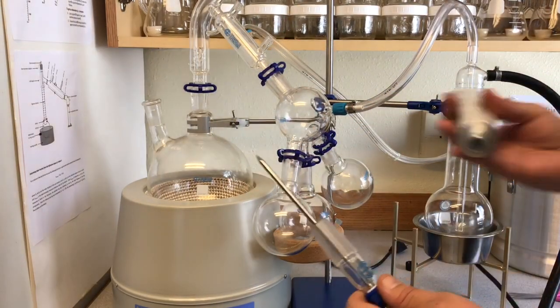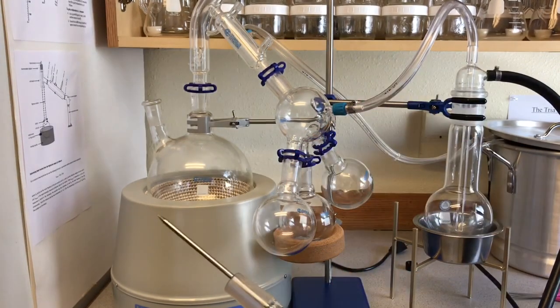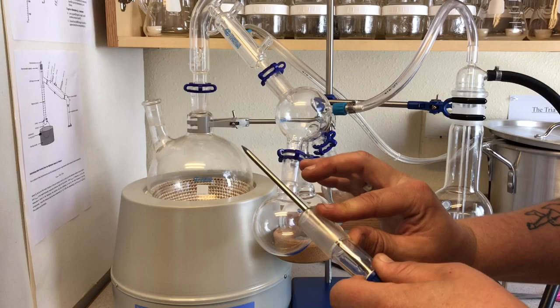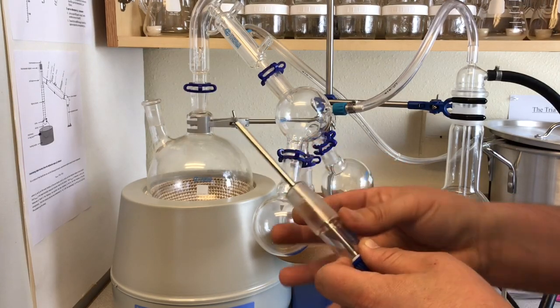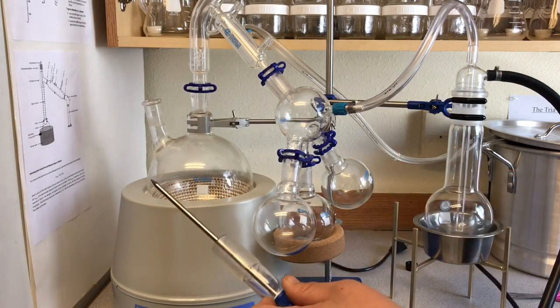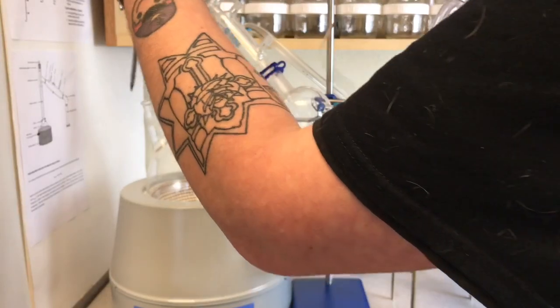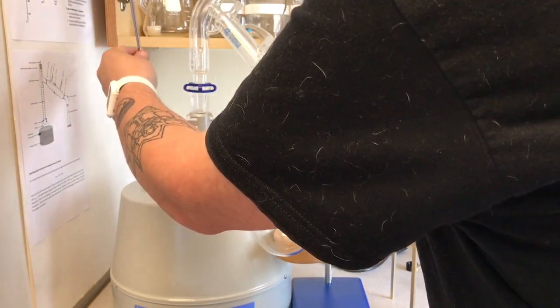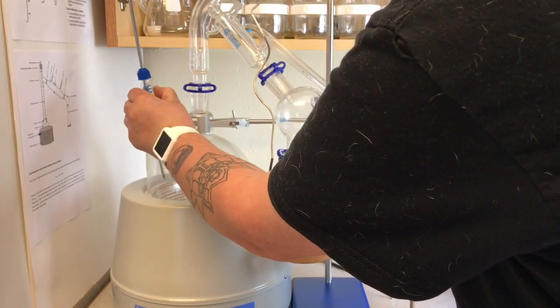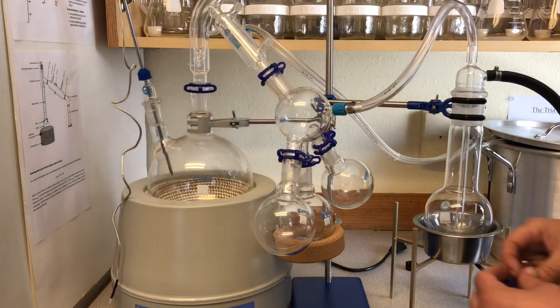We're going to want to use our Dow Corning vacuum grease again. Every time that we have glass on glass, we want to use our vacuum grease. If you don't use the vacuum grease, you run a risk of the joints seizing together. It's also a good idea to separate these joints, at least crack them open a little bit, while our apparatus is still hot. So when we get done running our material, we're going to loosen up these connections before we allow the whole apparatus to cool off.